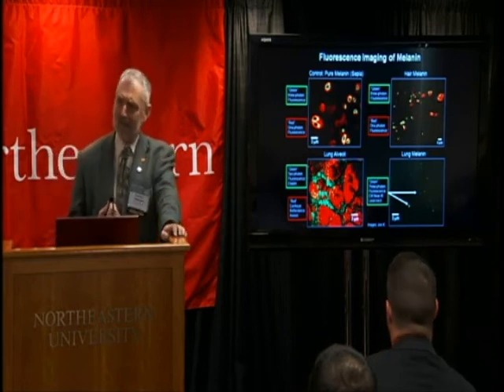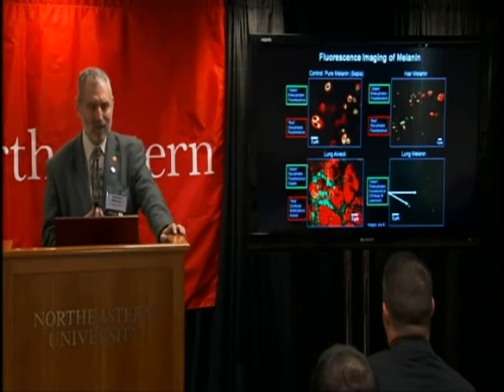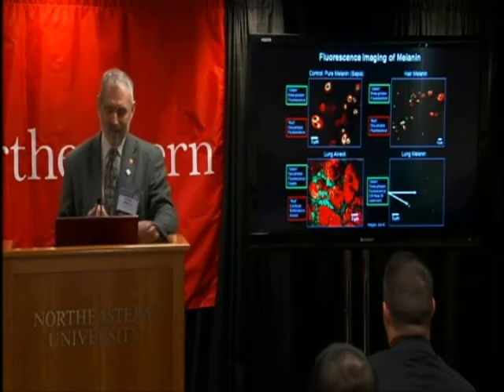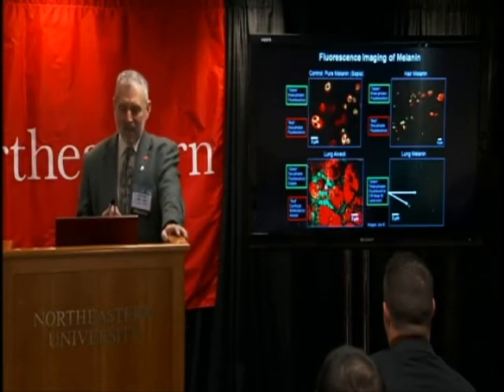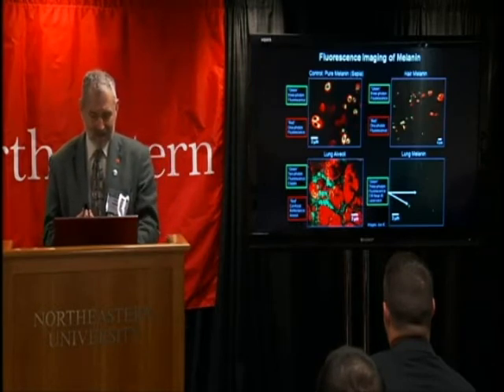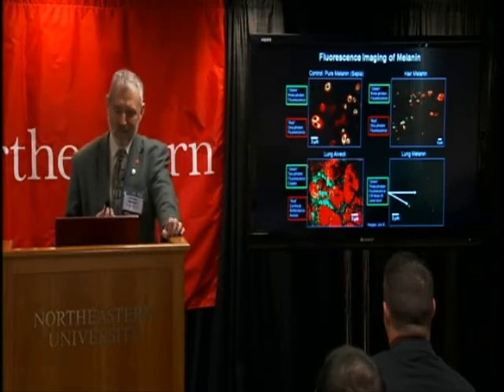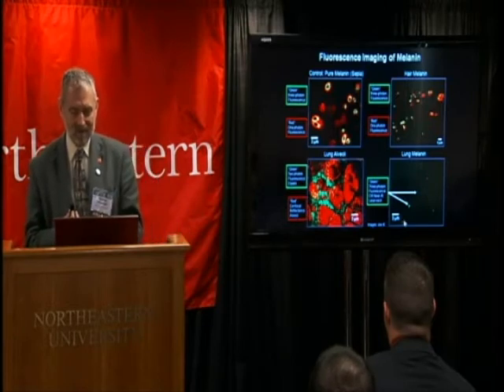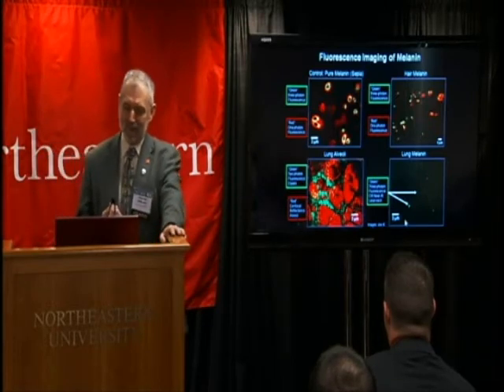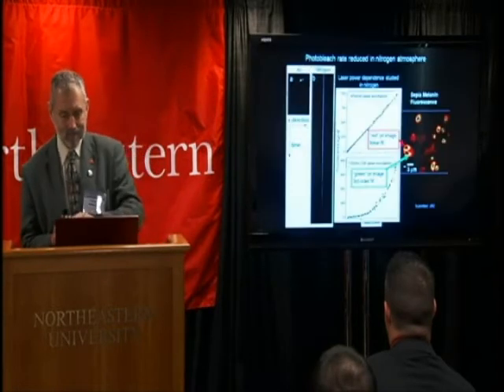And just coincidentally, on another project, we were imaging lung, looking for a two-photon process to detect elastin, which you can see in this lower left picture. And we saw these little flecks of what looked like melanin in the alveoli of the lung. We went to CW excitation. Everything disappeared except for those flecks. So we believe that there's actually melanin there in the lung.